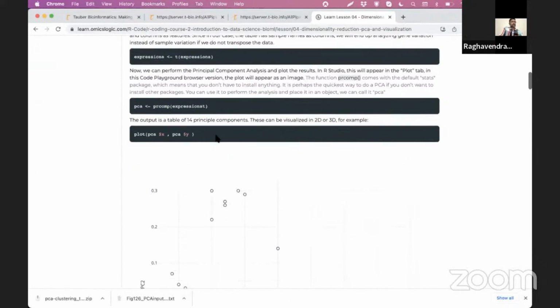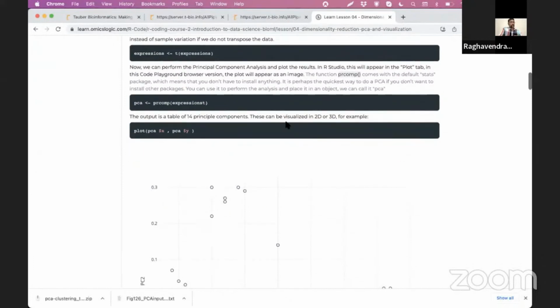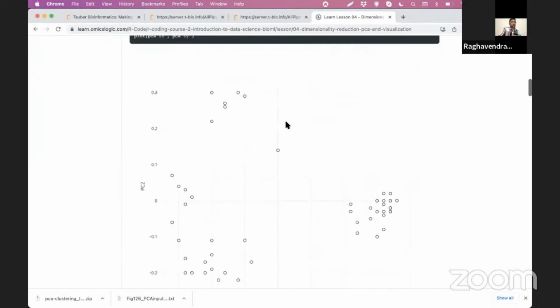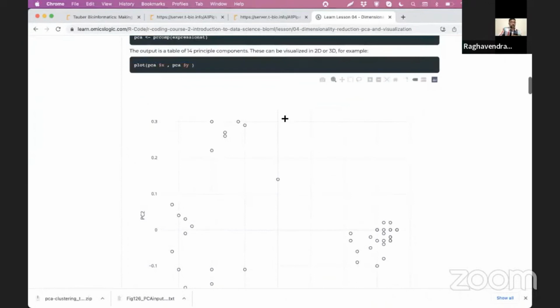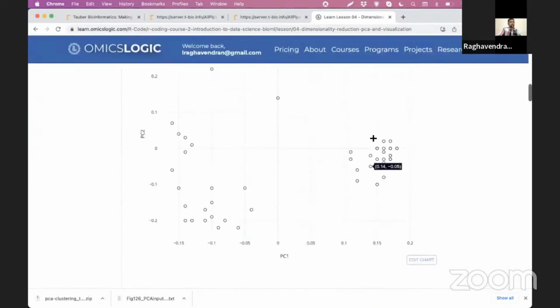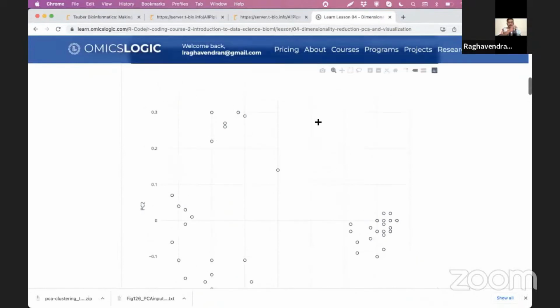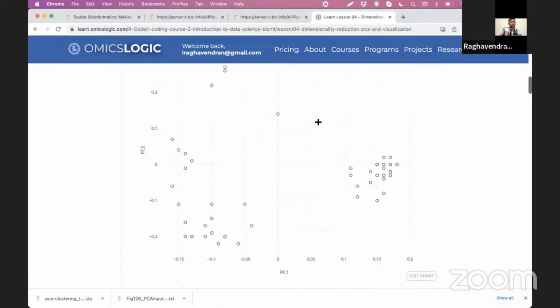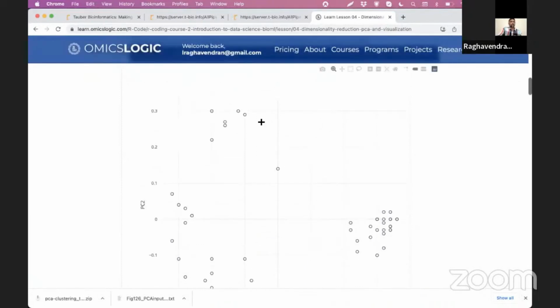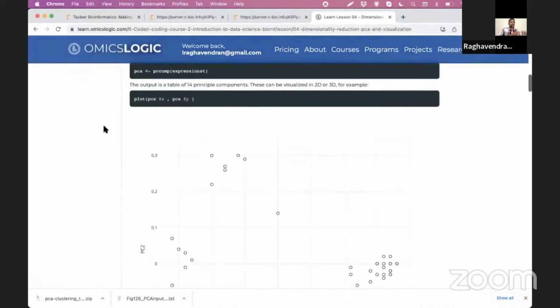At the basic level, we can plot the first two components, PC1 and PC2, and we can see that it produces some good separation of samples. But this is just to see whether we have any outlier in our sample, or how we go about interpreting our data. So this is a very basic plot, which gives us very little information.